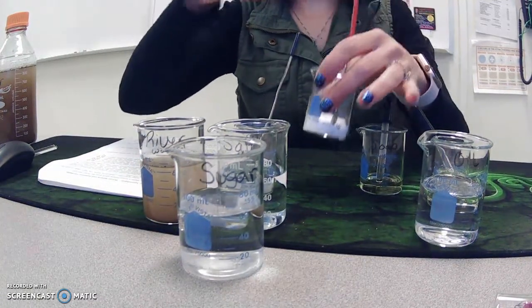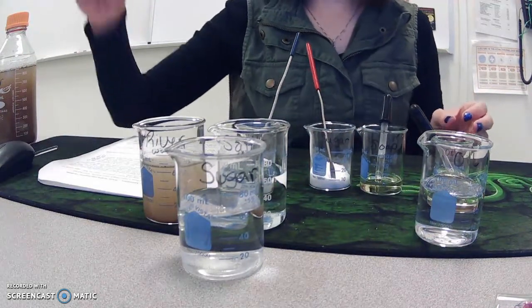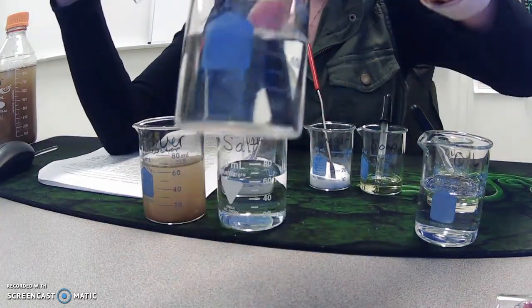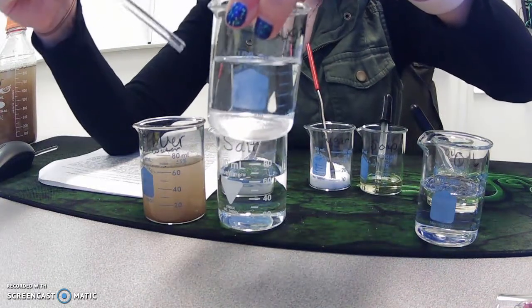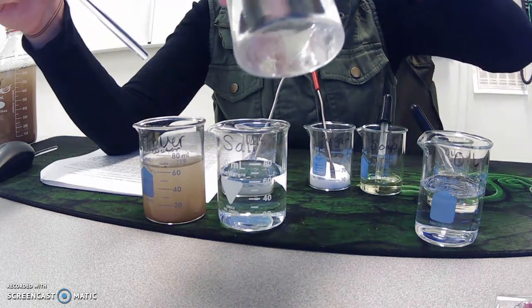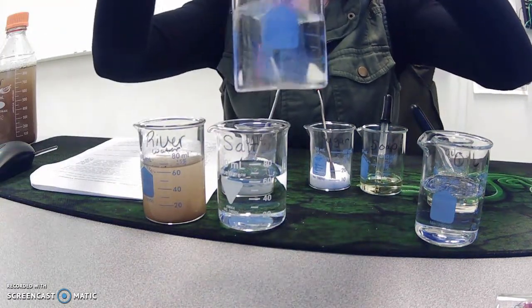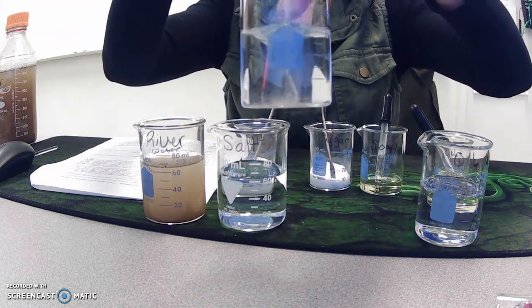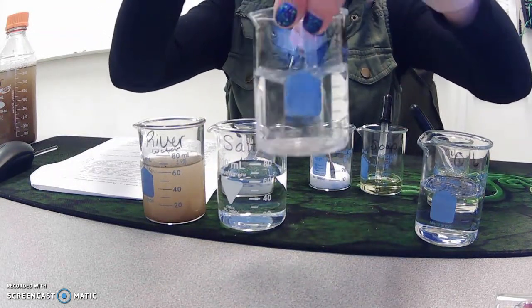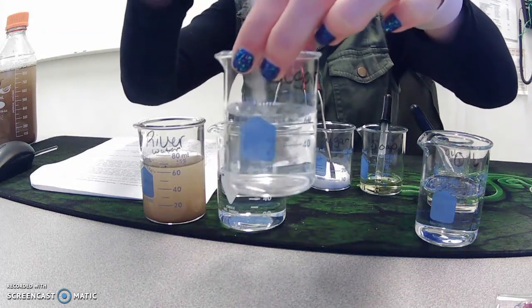Okay, so you can see it's at the bottom right now. If we take our glass stir rod, there's some that's kind of at the bottom. It's not all visible. You can see some of it right here. As we stir the sugar into the water, what is happening to the sugar?